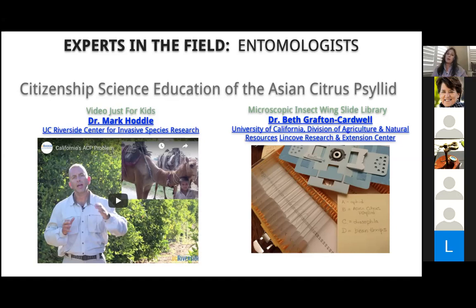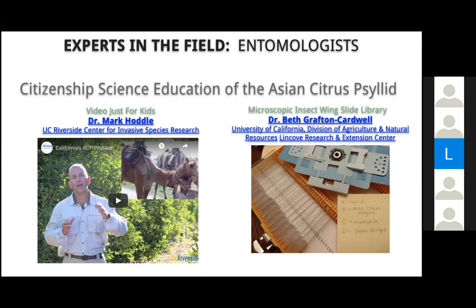But starting this school year, I will be sending Foldscopes home. We're not going to be able to fold them together. And I'm starting the year with life science standards. So I will let everybody know how it goes. I'm anticipating that it's going to be extremely successful.